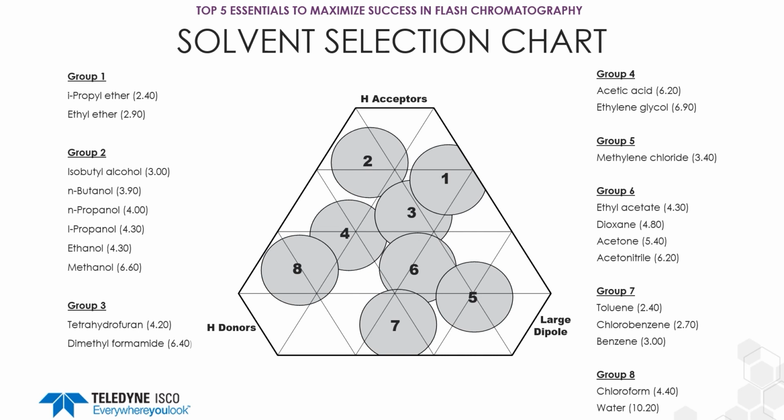So acetone is more non-polar. And in this case, in reverse phase, that's going to make it a stronger solvent compared to acetonitrile. So the hope would be that since you're using a stronger solvent, you're able to pull more compound off of that C18. But the better idea is actually to switch groups, switch the properties of those solvents.